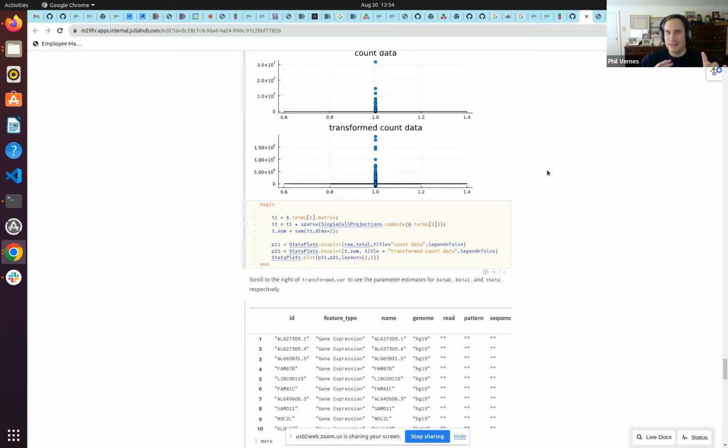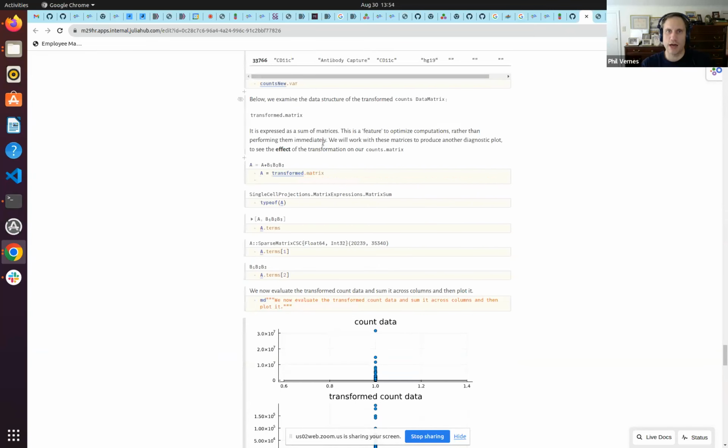So I think it's spend the 1 or 2 hours on very basic Julia, just to learn multiple dispatch and generic functions. Just know that basic thing and some basic stuff about types, and that's all you need. Because then you're not intimidated by this, right? When you see this as your data matrix, because remember, this is the data matrix for the transformed data matrix.